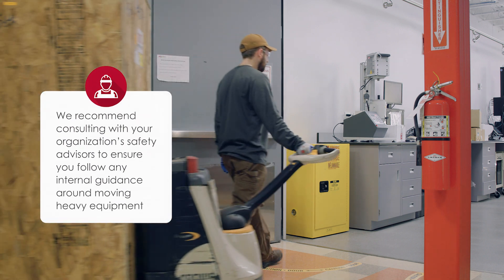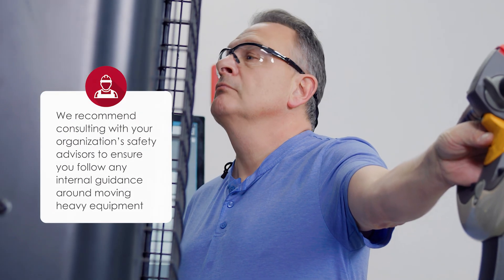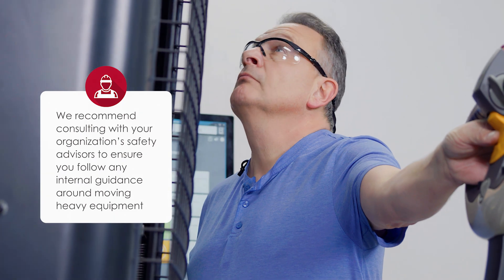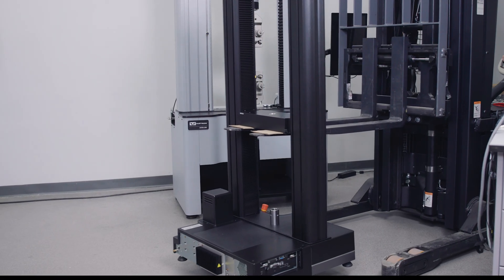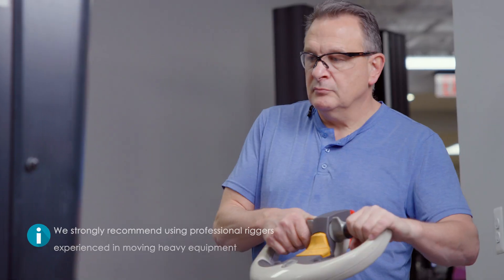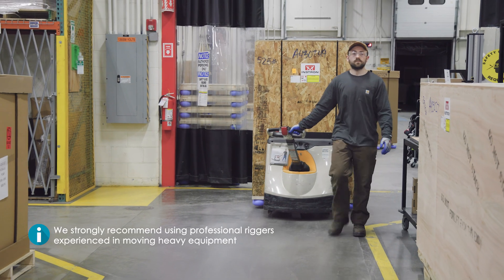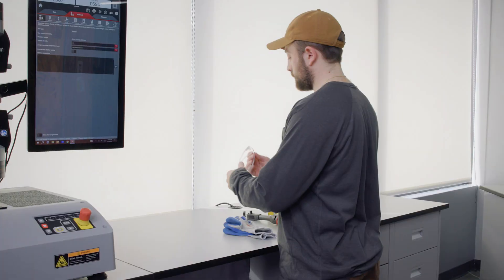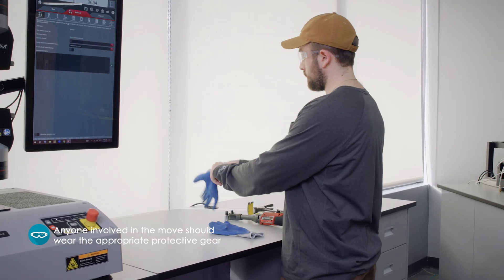We also recommend consulting with your organization's safety advisors to ensure you follow any internal guidance around moving heavy equipment. When it comes to moving a dual column table model universal testing system, Instron strongly recommends using professional riggers experienced in moving heavy equipment. Anyone involved in the move should take care and wear the appropriate protective gear.